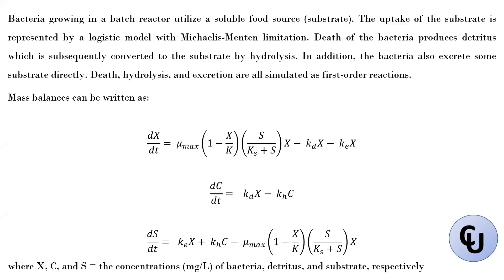Hello, welcome to another video on GPROMS. Today we are going to look at how to simulate a batch reactor, basically a bioreactor in GPROMS.